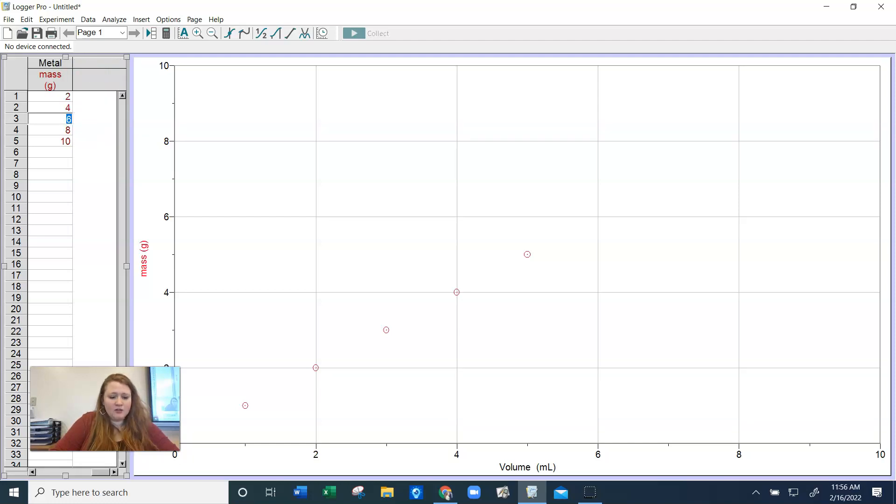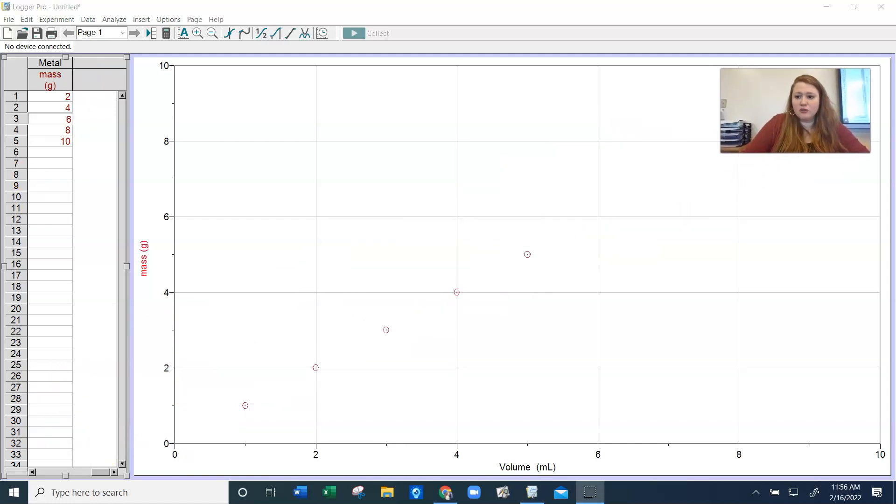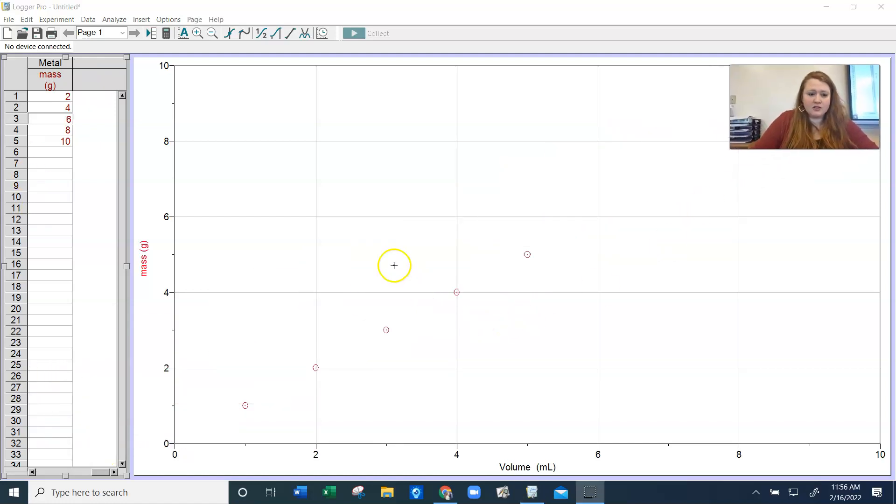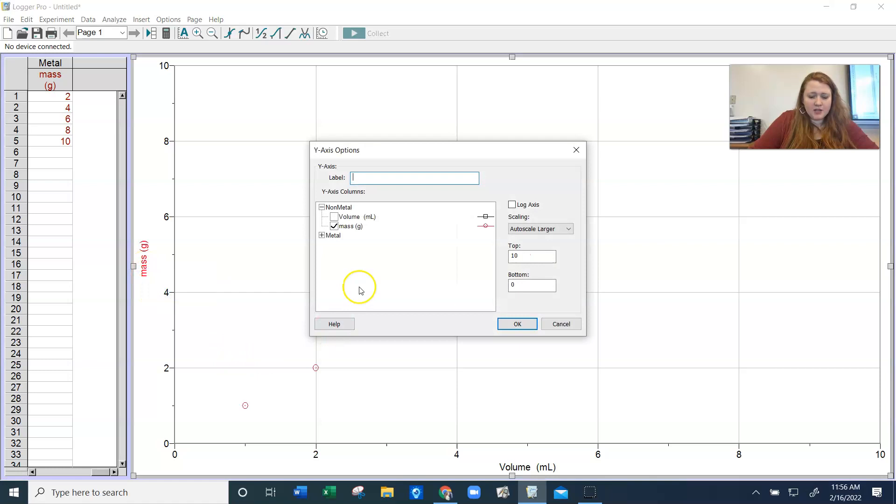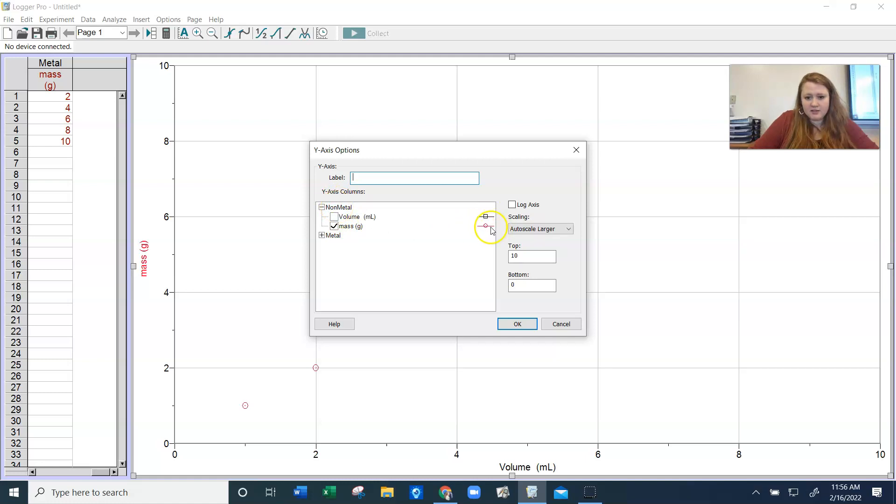So all of our data is nice and organized. And here is where you're going to get two lines on your graph. I'm going to come over here to double click mass, and we want more. So right now, it's graphing the mass for our non-metal. So our non-metal is these open circles here.